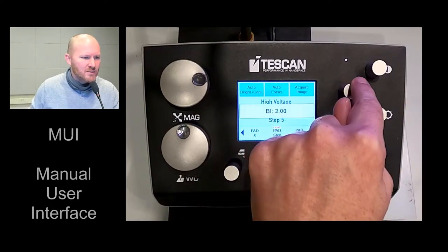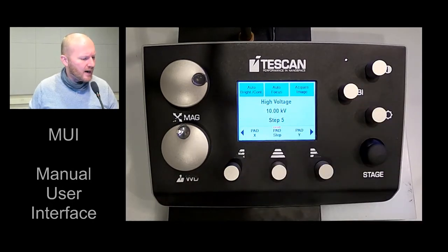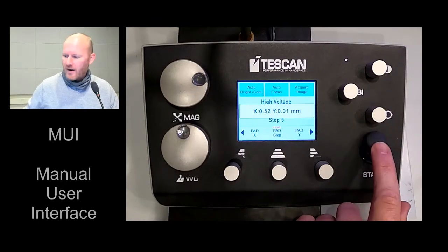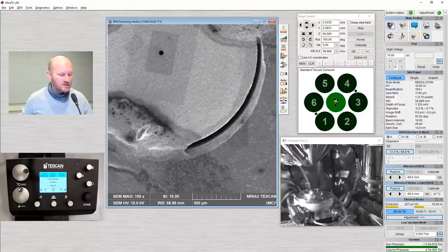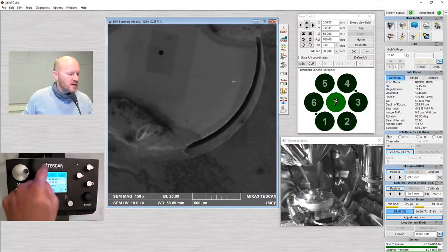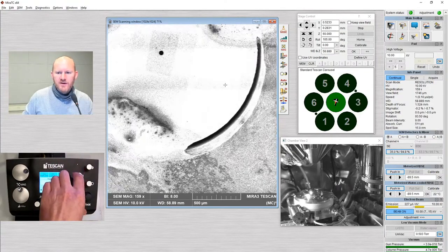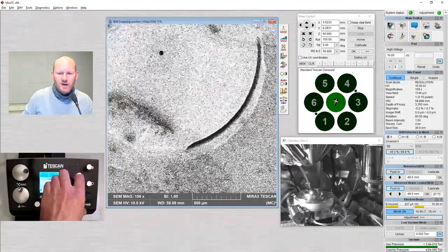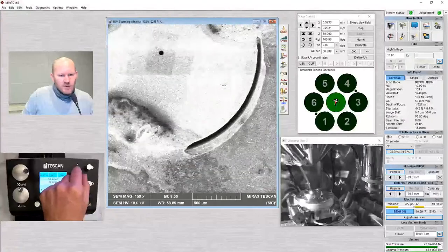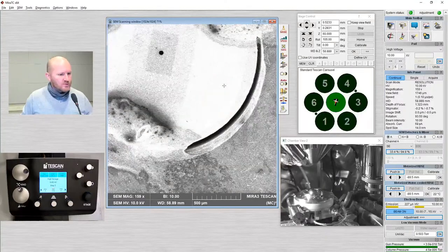You can see this is a very noisy image at low beam intensity. Going up to beam intensity 20, we have very high current and a high signal image, but the resolution drops. If I go down to beam intensity 1, you see it's very noisy. I'm going to get good signal to noise at 10, so that's what I'm going to use today.